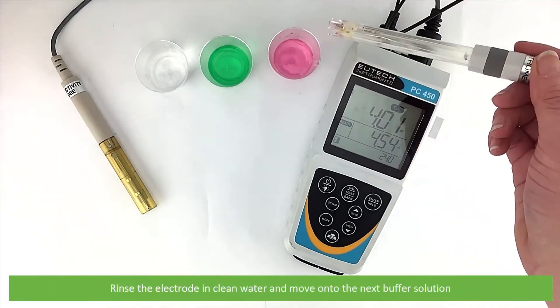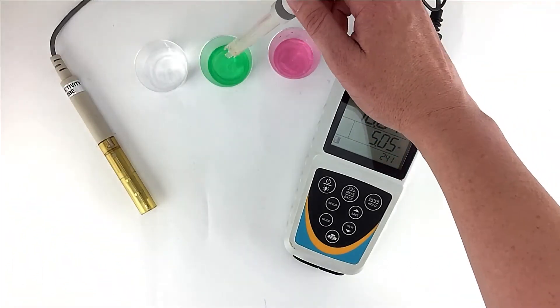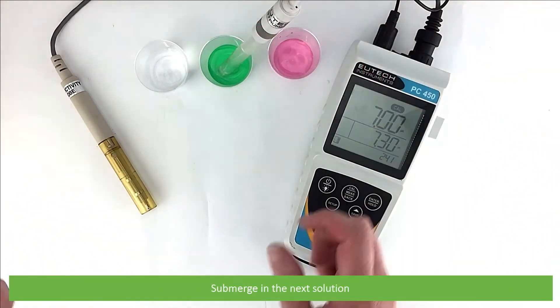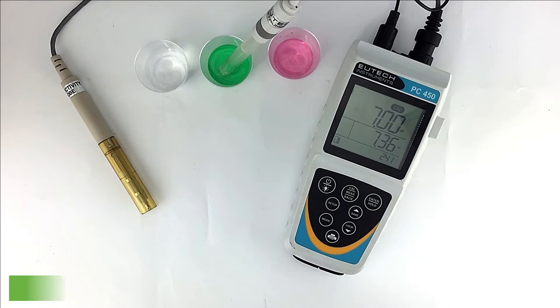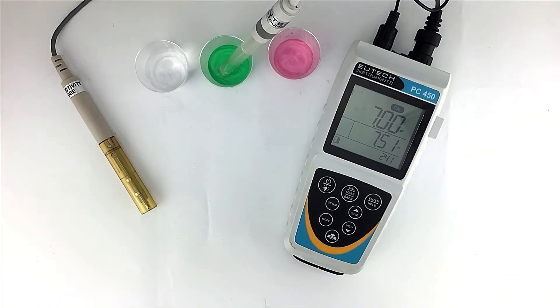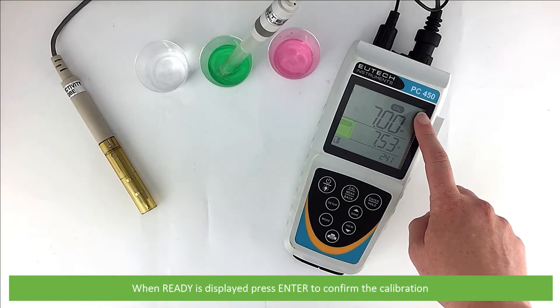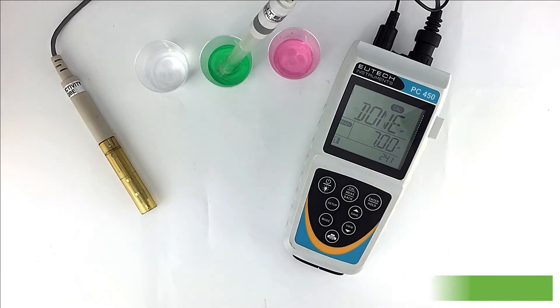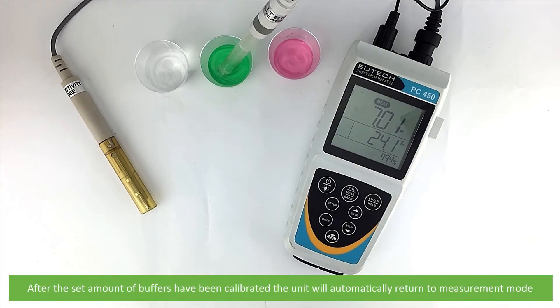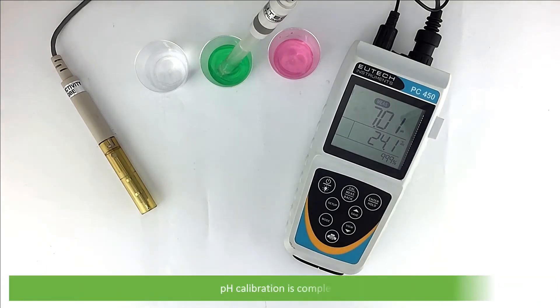Rinse the electrode in clean water and move on to the next buffer solution. Submerge into the next solution and wait for the reading to stabilise. Once stable, Ready will appear on the screen. When this is displayed, press Enter to confirm the calibration. After your set amount of buffers have been calibrated, the meter will automatically return to measurement mode. pH calibration is complete.